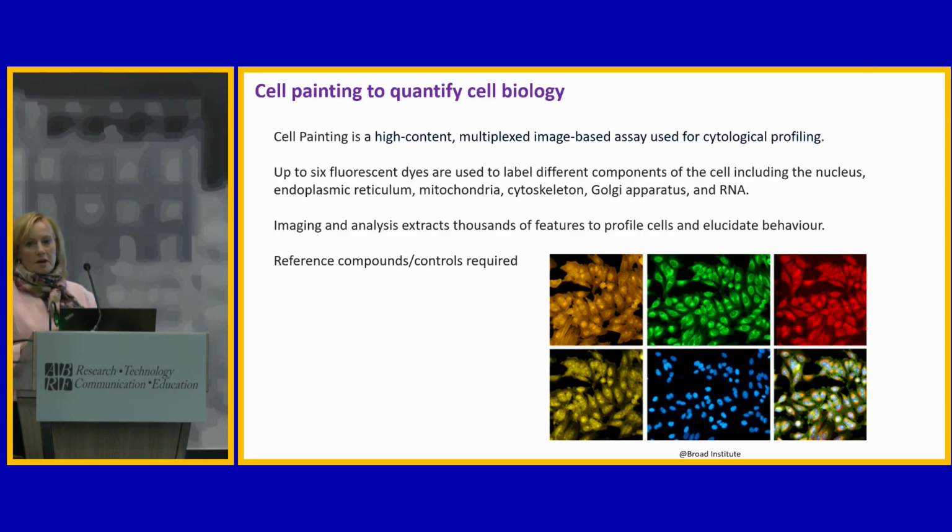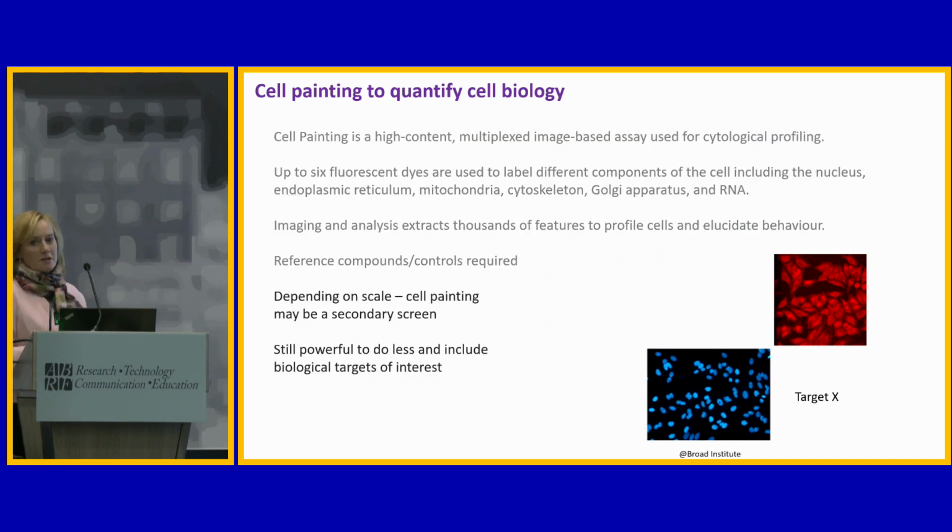Erin's already introduced the idea of cell painting, so I don't need to say any more about that, other than to say that we don't use it every time. It is a little expensive in Australian dollars. So sometimes we do the poor man's cell painting, and we might just have 1 or 2 channels. Here we've just got DAPI and a phalloidin channel.